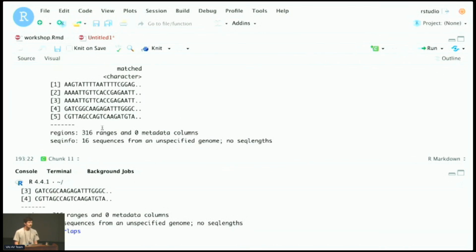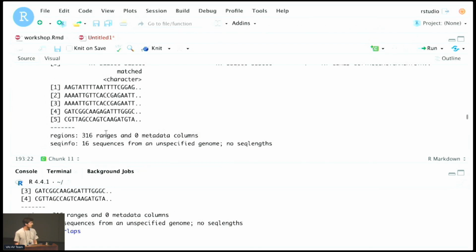But it's another package that I wrote specifically for chromosome conformation capture data. It's called HiContacts, and it can plot genomic interactions as a matrix. So what you'd typically see in Hi-C or Micro-C papers. All right, cool. Yeah. Thanks.